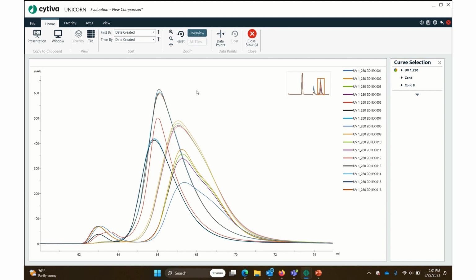I would say that just looking at this, I'm guessing that these peaks are all pH 8 and these are all pH 9, though actually probably not true, because I remember when we did the resin selection, some of the peaks were a little bit to the left and a little to the right, so if we could look at this, we could probably tease this out, like all the DEAE peaks are always over on the left side or something like that. That would be really interesting to figure out.